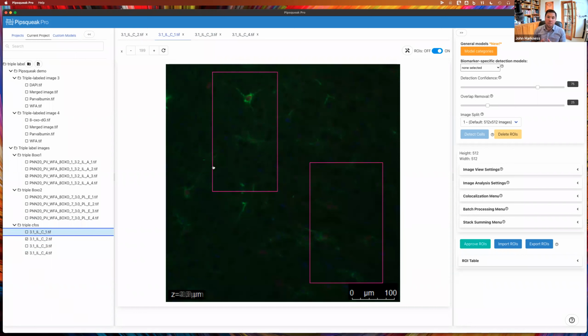But to separate out those 2 different stains is definitely going to be most accurate just by looking at each channel independently. So could that be from a single image, separating those 2 out into 2 different channels? Okay. Yeah, we don't have the capability to pull those images apart in Pro right now. So you probably want to import those images in already separated out.